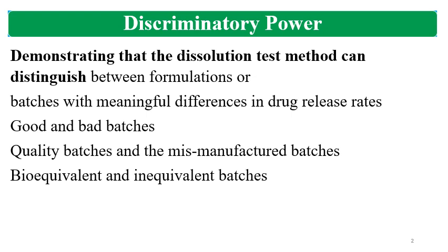Discriminatory power is required to be proved, and the dissolution method should be discriminatory whenever you are developing formulations. It means demonstrating that the dissolution test method and the dissolution test specifications can distinguish between the formulations, or distinguish between the batches which are good batches or bad batches.